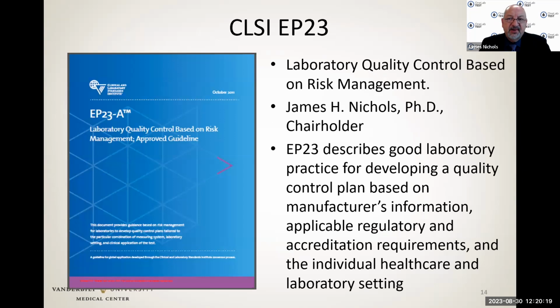This is summarized in EP23, the CLSI document, Laboratory Quality Control Based on Risk Management. I had the privilege of being the chairholder for this committee of experts. And EP23 describes good laboratory practice for developing a quality control plan based on manufacturer's information, applicable regulatory and accreditation requirements, and the individual healthcare and laboratory setting.